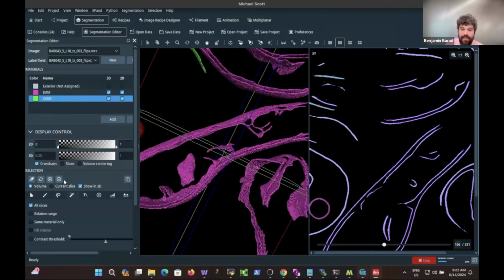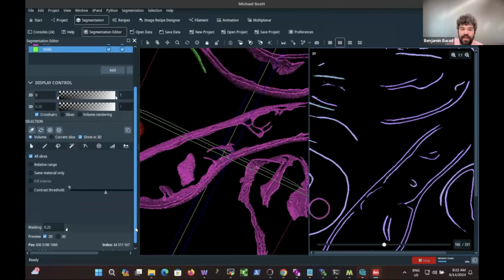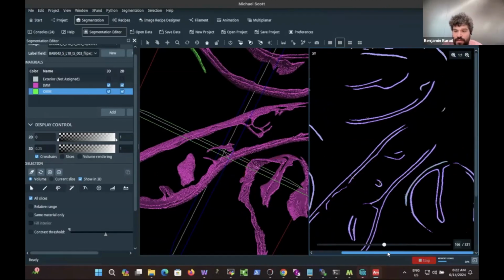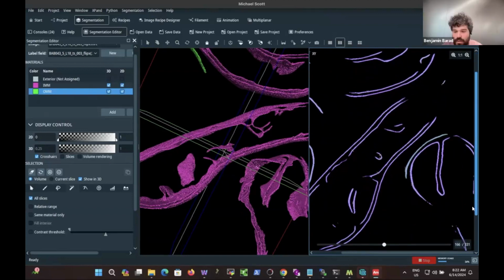As far as subtomogram averaging, we've been doing PyTom particle picking, which is a template matching algorithm. But I don't know that I have a strong instinct that that is the best segmentation algorithm. It's just, you know, one that works. Great. Thanks for sharing. Sure.